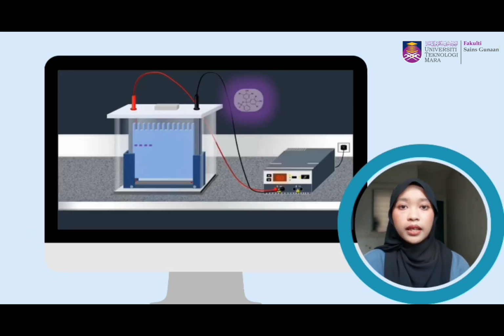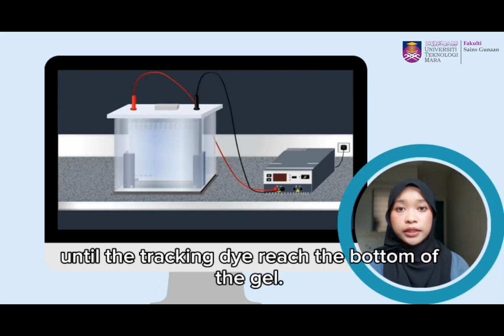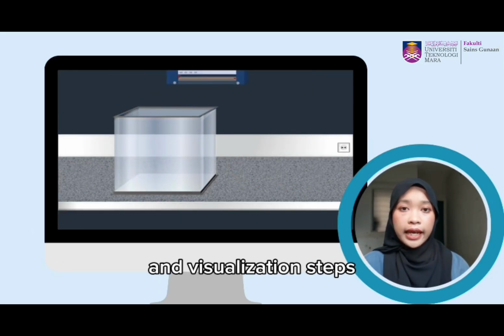gel. And now, the electrophoresis process continues until the tracking dye reaches the bottom of the gel. At this point, the power supply is turned off and the gel is removed for staining and visualization steps.